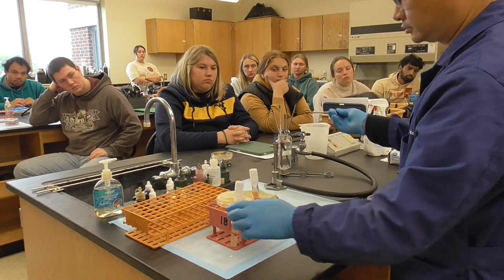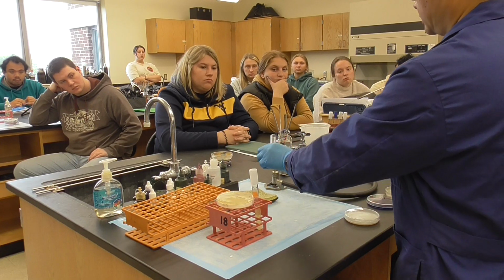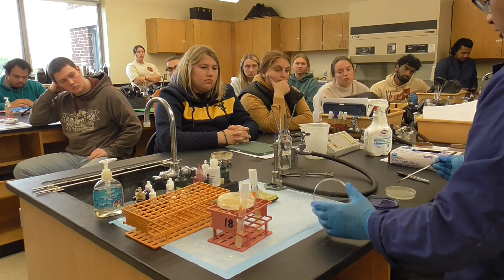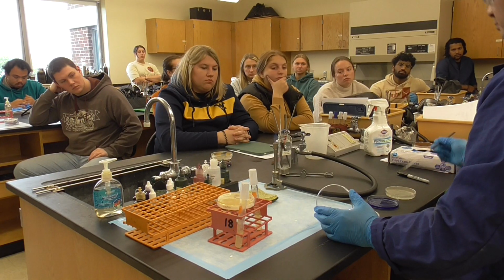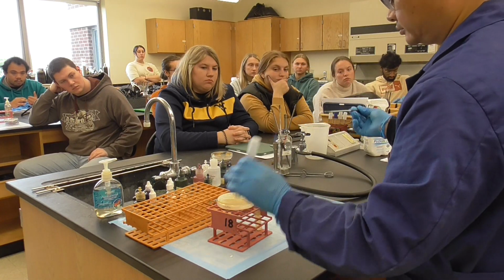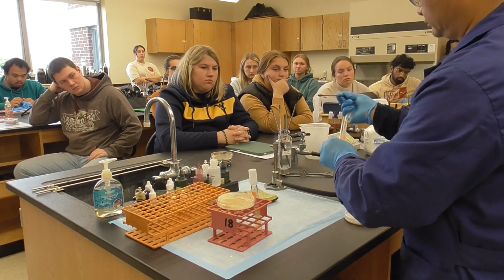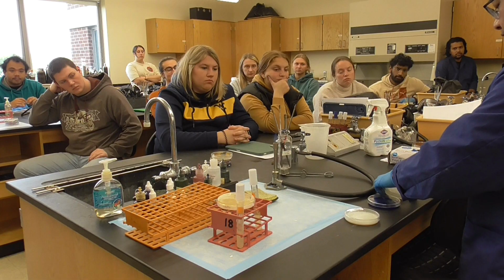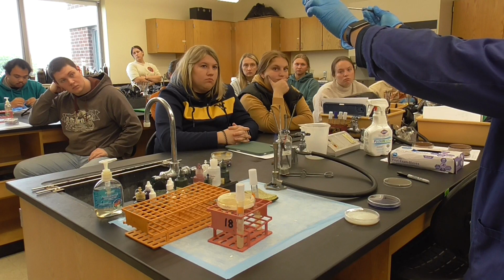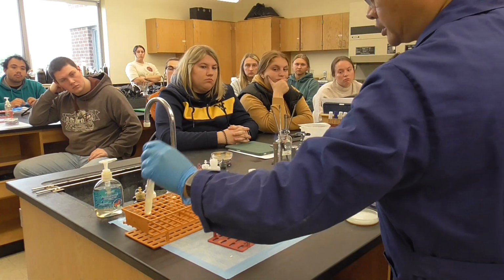Flame the loop. Get the bacteria. Which side is E. coli? This side is E. coli, so very gentle. That's E. coli. Okay, flame the loop again. Get the E. coli. So where do you go? Let me show you one more time. This one I have to do like this. Just a very gentle streak. That's all. E. coli is done. Okay, put it on the side.